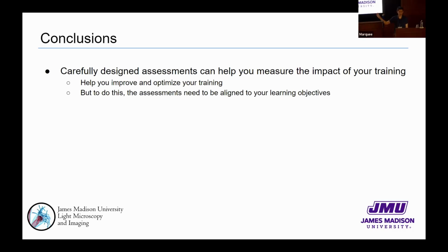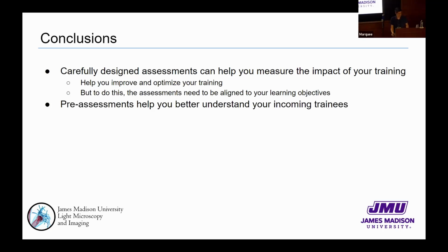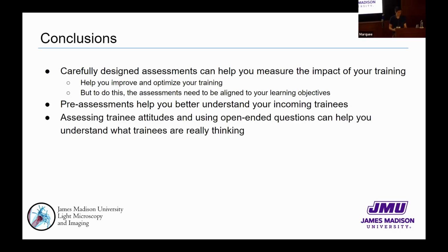And again, this is a whole process which Sylvie outlined briefly. To know more, go to Sylvie and Rhonda's workshop. It's amazing. You should go to it. Pre-assessments can help you better understand your incoming trainees. So have an assessment before, not just after, because you can compare the two.